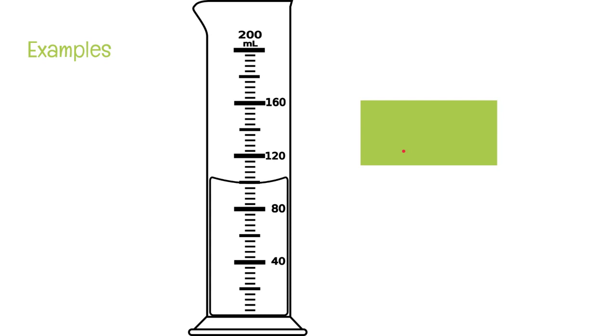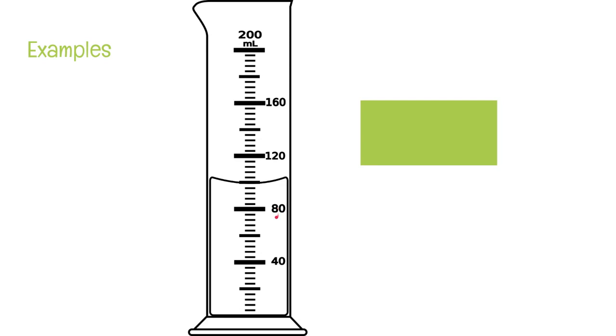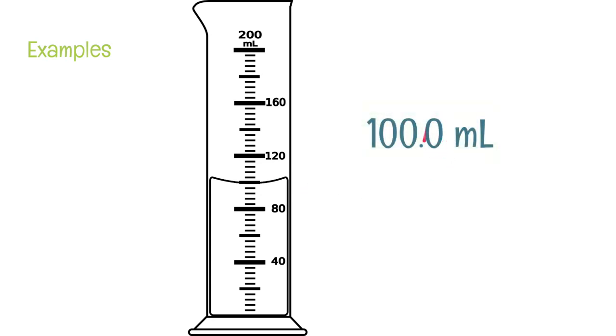We're still agreeing on this 100, and that is the important part. Okay, this one's a little different. The numbers written here go by 40s. So this big bold line in between 40 and 80 should be 60. 40, 60, 80, 100, 120, 140, 160. If this is going to be 100, like I just counted before, and it's falling exactly on this line, everybody in the room is going to agree it's 100. But we need this estimated digit to say, hey, it's falling exactly on this line. This is 100.0.